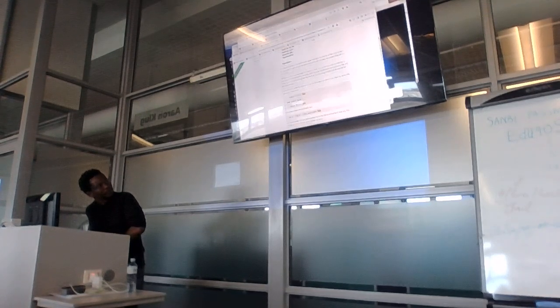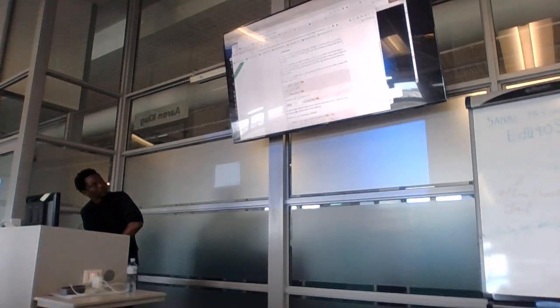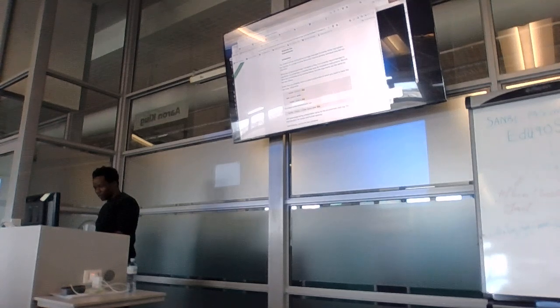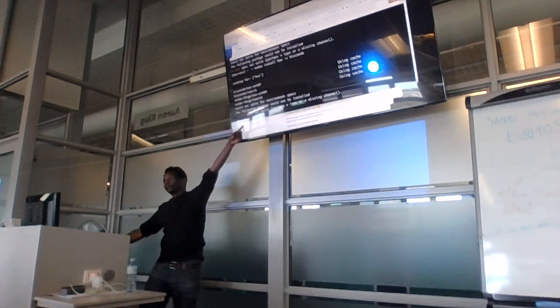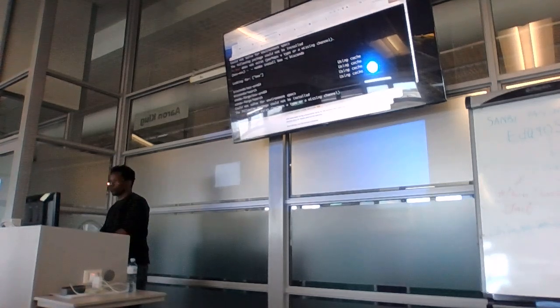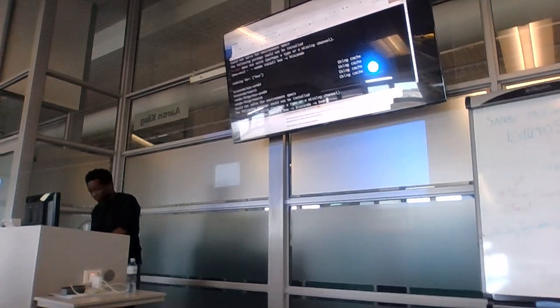So George, you need to add the name of the environment. Not within that, in the sense that I'm within the environment itself. So I'm within BWA. It still needs to. So add -n BWA.